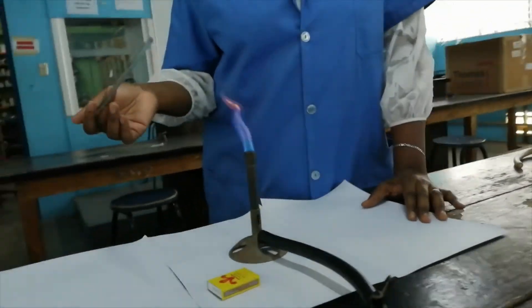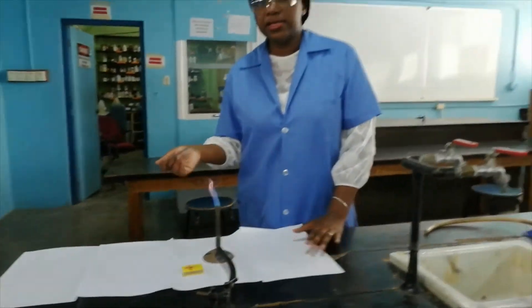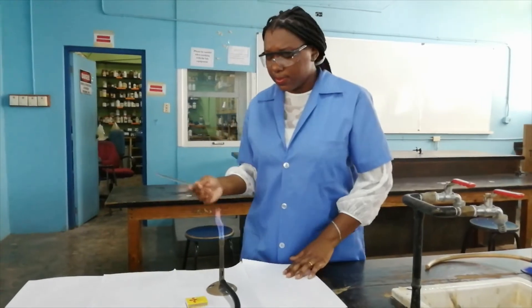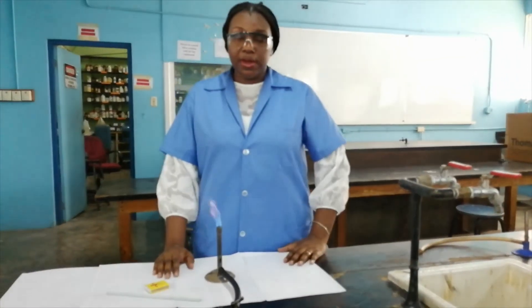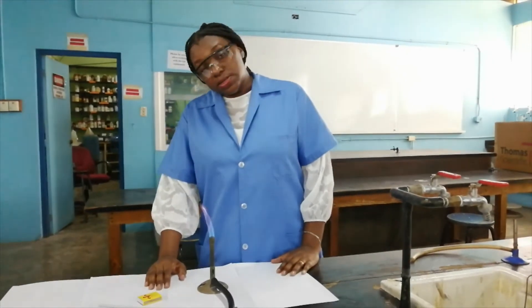We use the Bunsen burner for heating purposes, combustion purposes, and sterilization purposes. Now that I have shown you how to correctly light the Bunsen burner, I want you to pause.